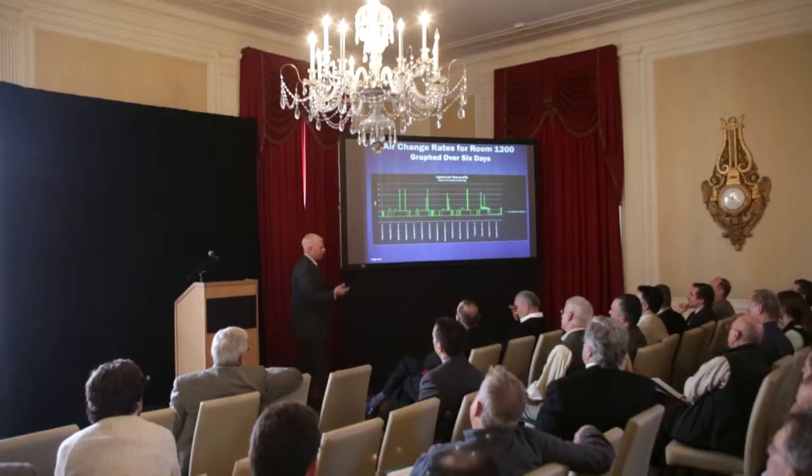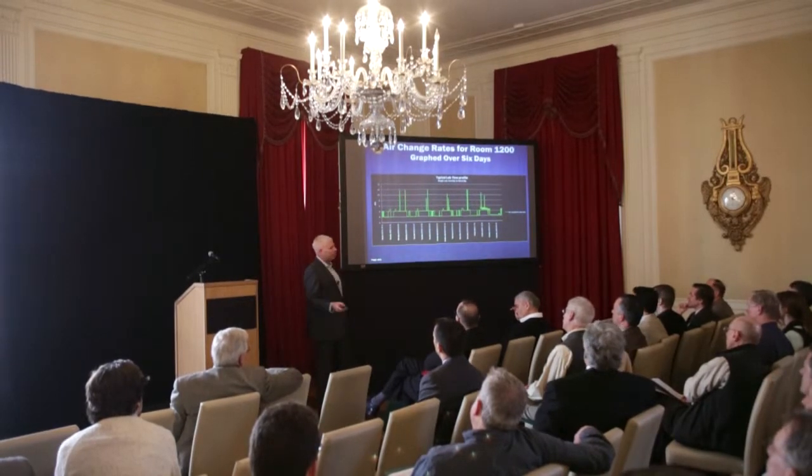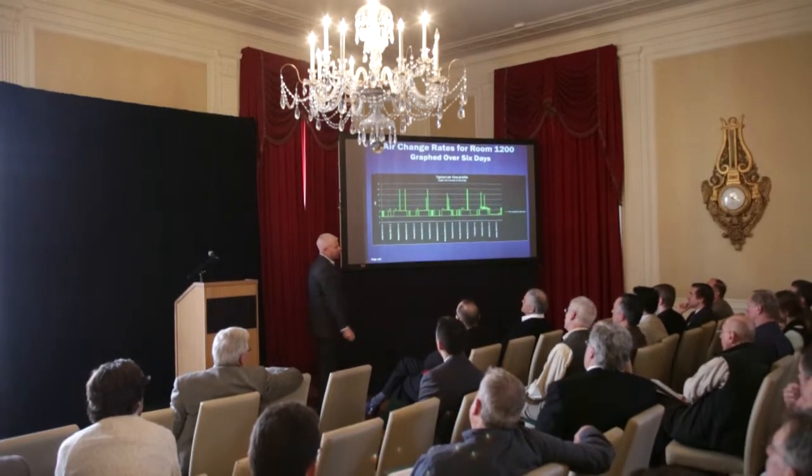It's seeing this huge VOC event, and it's able to clear it incredibly quickly because, it's obviously, 12 air changes, 15 minutes. That's a lot of air you're flowing through that space. And alcohol evaporates very quickly. So this is what you're seeing. But again, interesting data that you can't necessarily pull otherwise. What did it do? It generated an environmental health and safety response. It also generated an energy manager response, because I'm like, why are we doing this? So, again, it's something that actually generates a response. You probably don't have that ability right now.